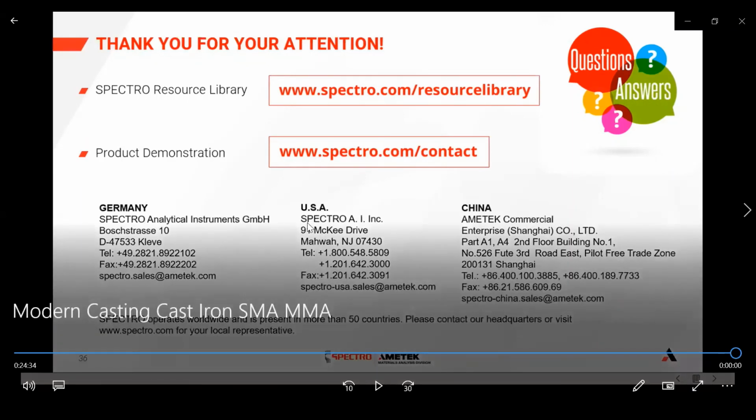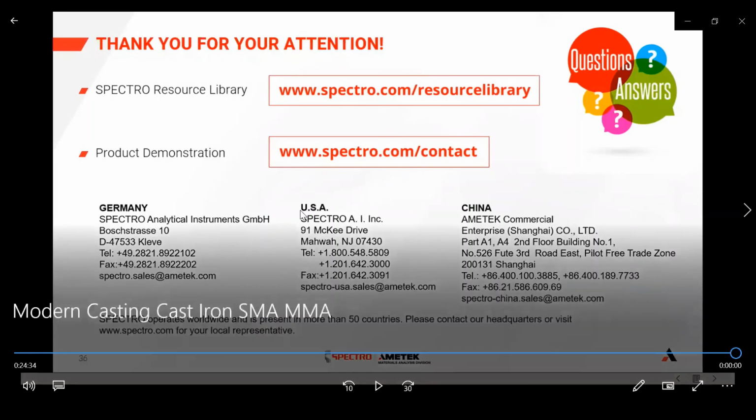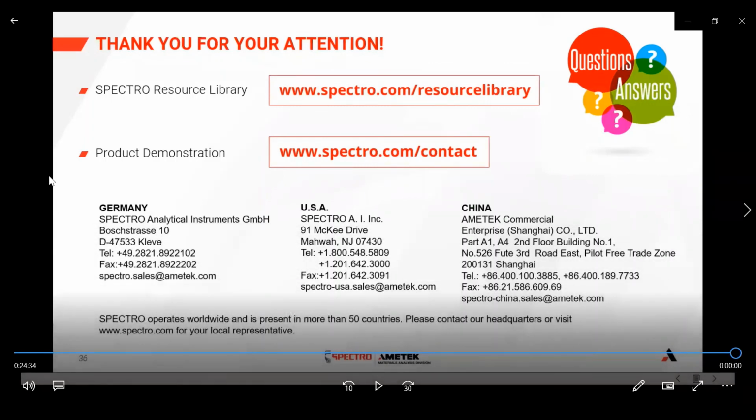Can an as-cast part be remelted and quickly cooled for analysis? Now, I'm not a metallurgist, so I don't know what losses you may have when taking an as-cast part and remelting it. It is certainly feasible. If you find that it is representative of your original melt, then yes, we would be able to use an as-cast remelted, rehomogenized and quickly chilled sample, using those copper molds and so forth, for the analysis. Yes.